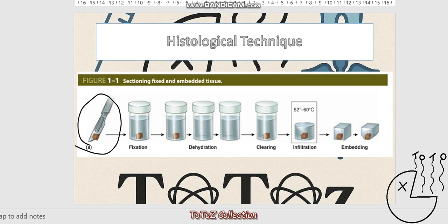And then the first step that we're going to do under our histological technique is called fixation. Now here, this is where we fixate our sample. What does it mean to fixate your sample? This simply means to denature all the proteins that are in this sample.